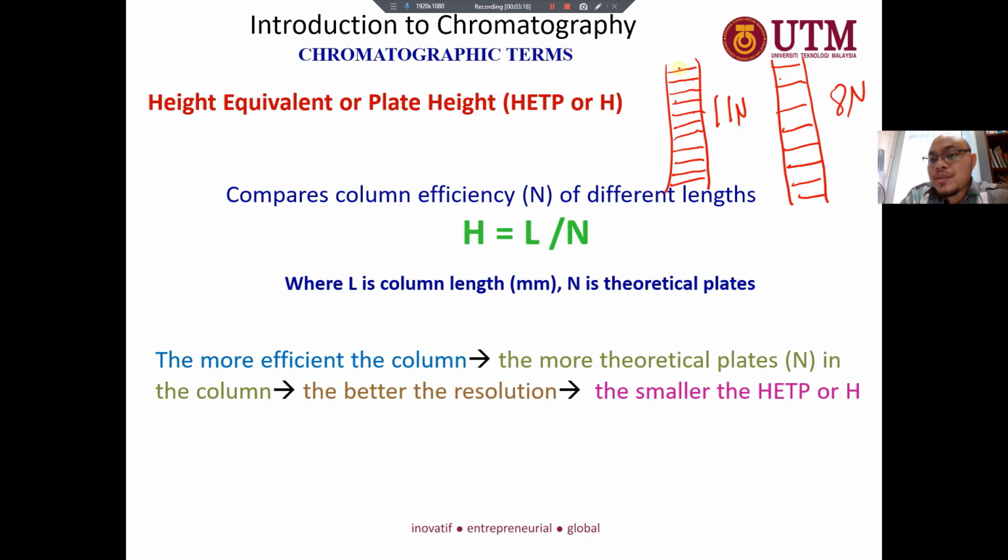Also, if you look again here, the distance between the plates is smaller compared to here. So this column has better efficiency.